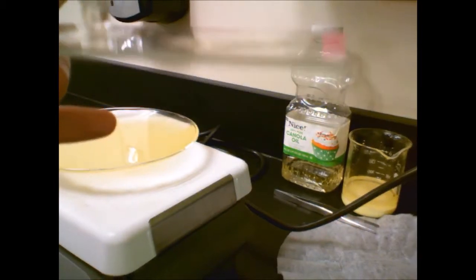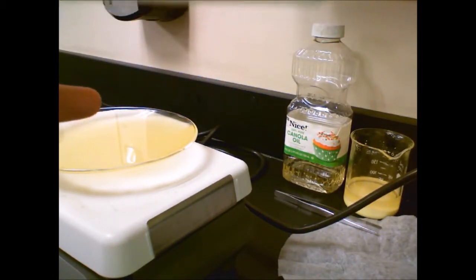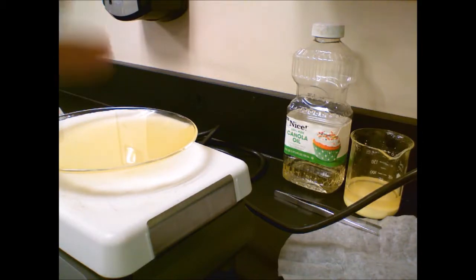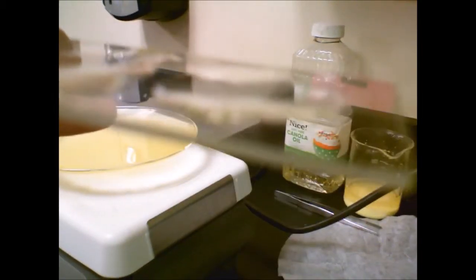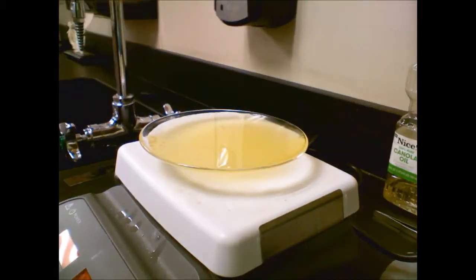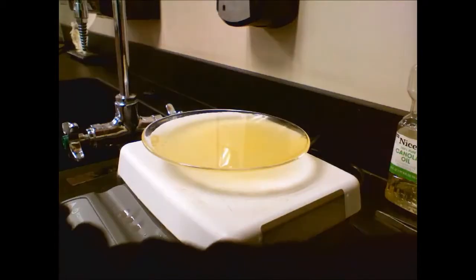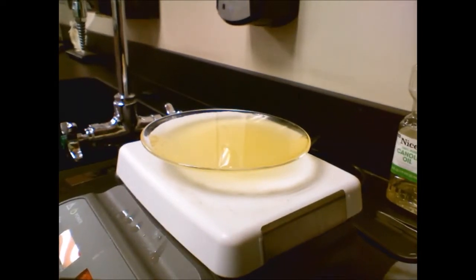My thought is that perhaps I can get those to act as seed crystals. I don't think they're going to grow very much bigger with just that much more sulfur, but it is worth the thought. We will check that out in the morning along with what happened in the watch glass. So, as always, we shall see.